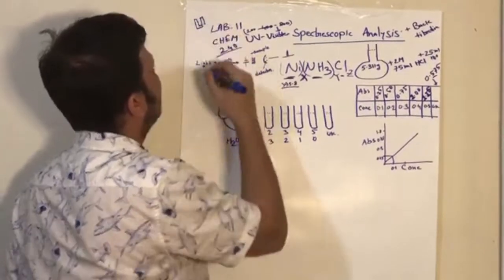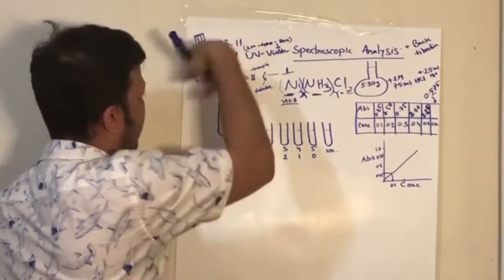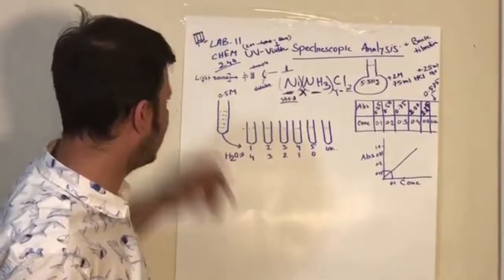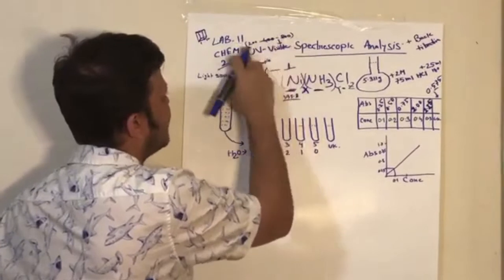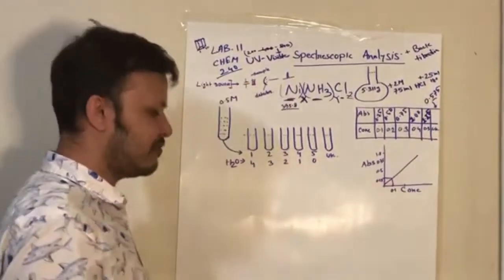Like that. Okay, you accept the length. This is 1 centimeter. This is 1 centimeter. All through the 1 centimeter. So anyway, this cuvette we will use. You will use the cuvette to put the sample in, and the light source from here to here will go through this. Okay, if it goes through this, then what will happen?